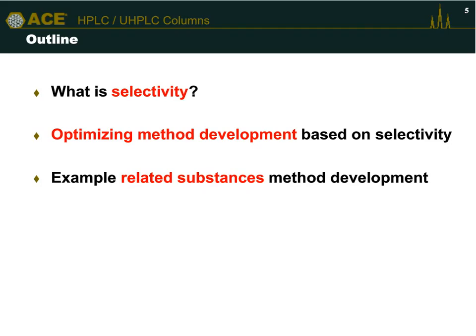As a brief outline to this webinar, I'll start by reminding us what selectivity is. I'll then talk a bit about how we can use selectivity to optimize our method development approach by considering key variables available to us to change to develop our method.